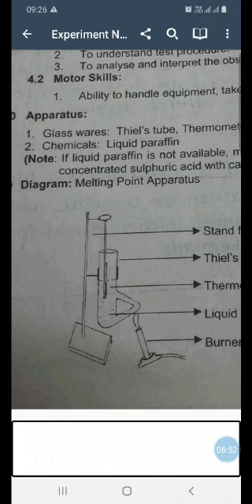For finding out melting point, you need to take a small capillary of medium sized hole. Your blood capillary will not be sufficient in this case. You need somehow broader hole or broader width capillaries. Take a glass capillary and seal its one end by holding it on flame for a while and move it continuously during holding, so that uniform sealing will be achieved.